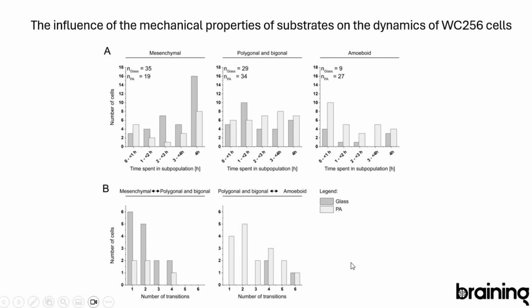We also measured how many times during the observation cells move from one state to another, and we found that the introduction of the elastic substrate influences the changes of these transitions.